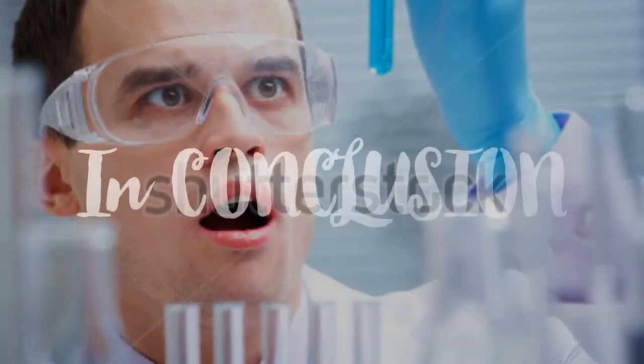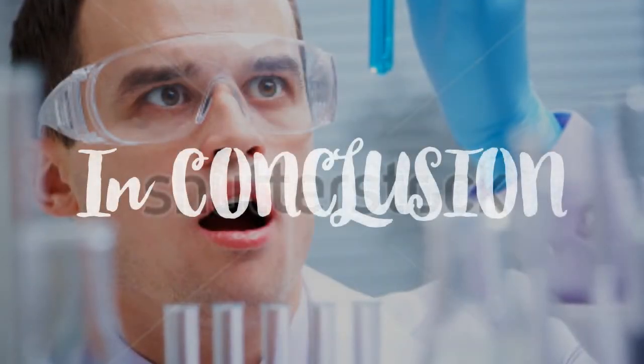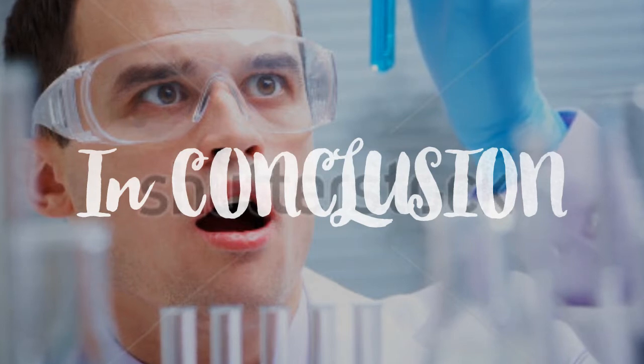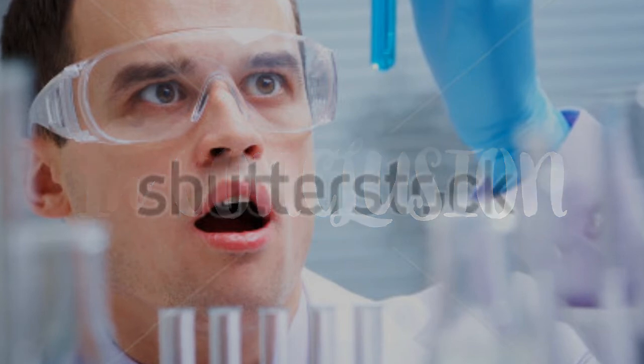In conclusion, our synthesis of benzyl acetate was successful for both the base catalyst and the reflux base catalyst, as well as the regular reflux synthesis. After having undergone the workup processes for all 3 synthesis reactions, the IR and NMR data indicated that the ester benzyl acetate was produced.